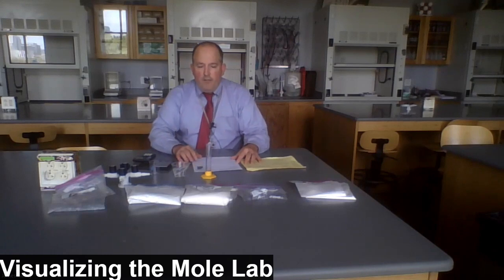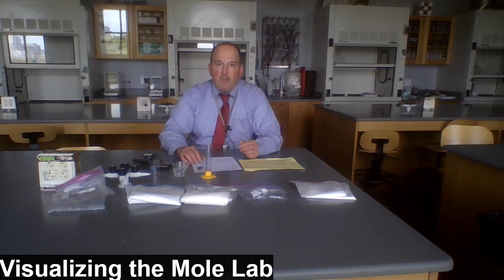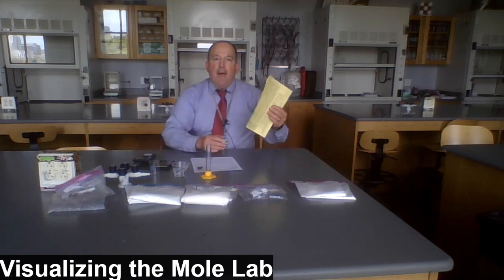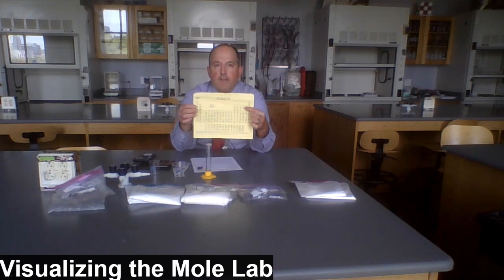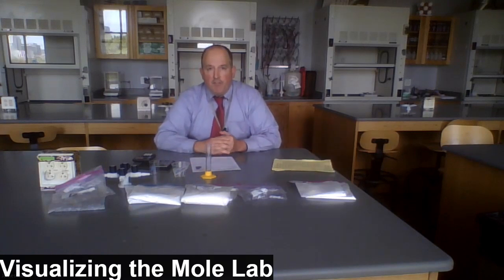In station 1, they're going to ask us to pour out 1 mole of water into a graduated cylinder. Remember that for water, 1 milliliter equals 1 gram. That's its density as defined by the metric scale itself. Now, H2O is water's formula, so the mass of 1 mole of water can be found by adding together the atomic weight of 1 atom of oxygen, which is 16, plus 2 times the atomic weight of hydrogen, each of which are 1. So 16 plus 2 is 18 atomic mass units.